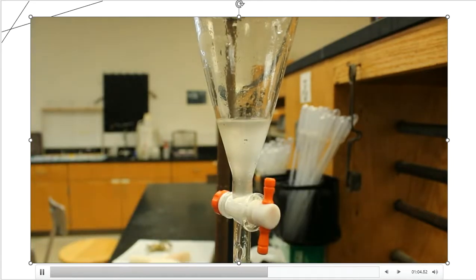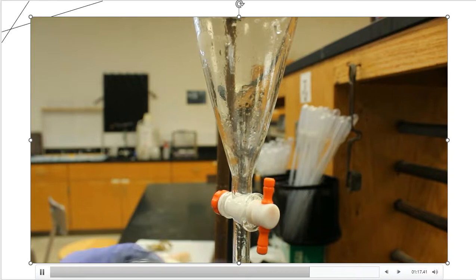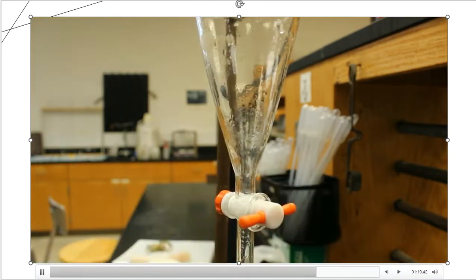All right. Now this layer is a different layer, so I'm also going to drain that as well into a separate container. I could actually just take the separatory funnel off and pour it out that way, but I always like to give it a good flush. So it's just procedural. Okay. So I'm going to close the separatory funnel off.